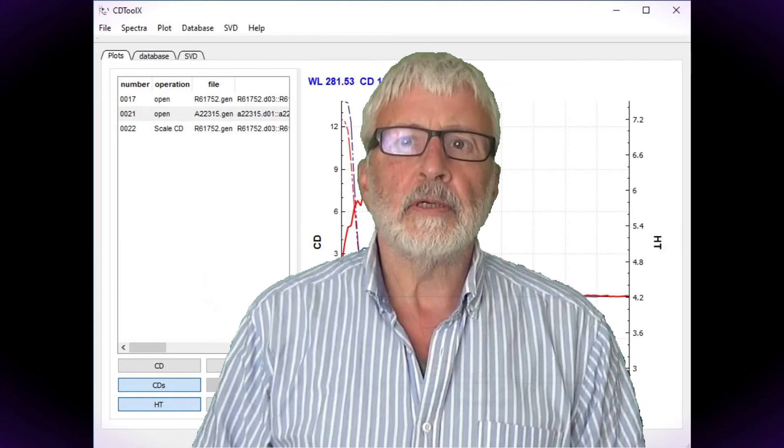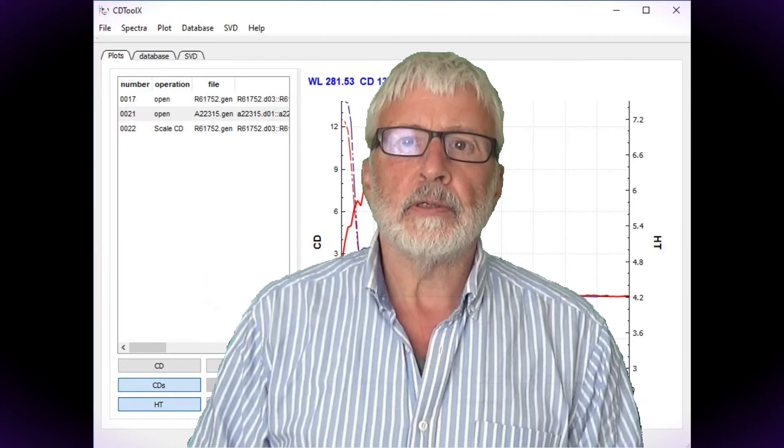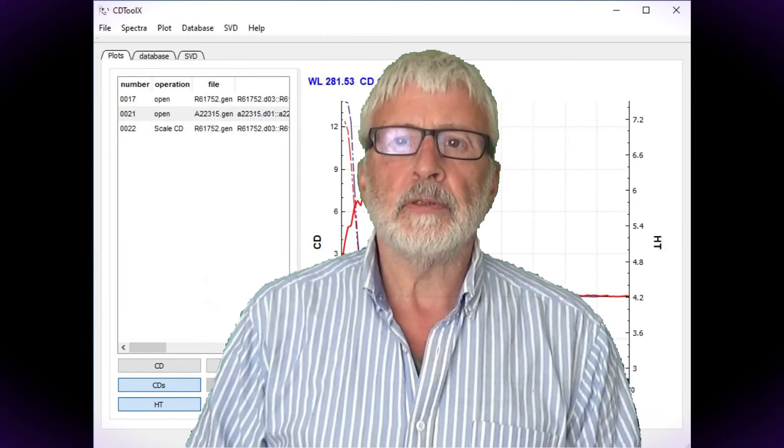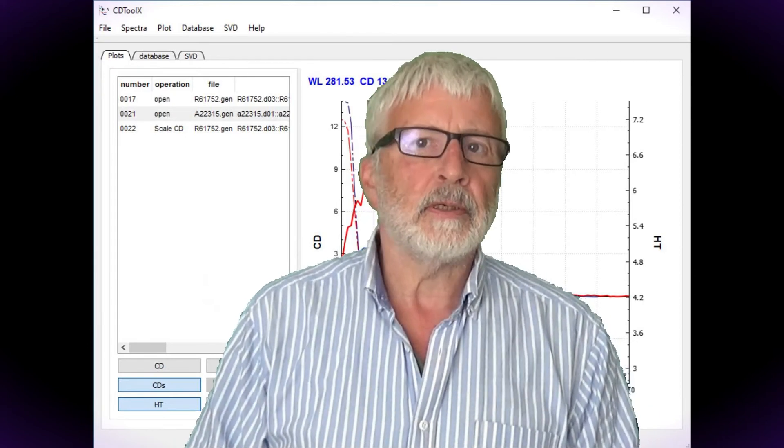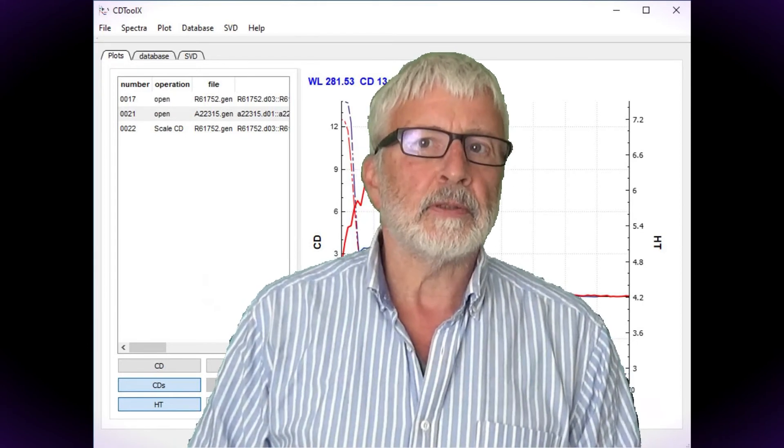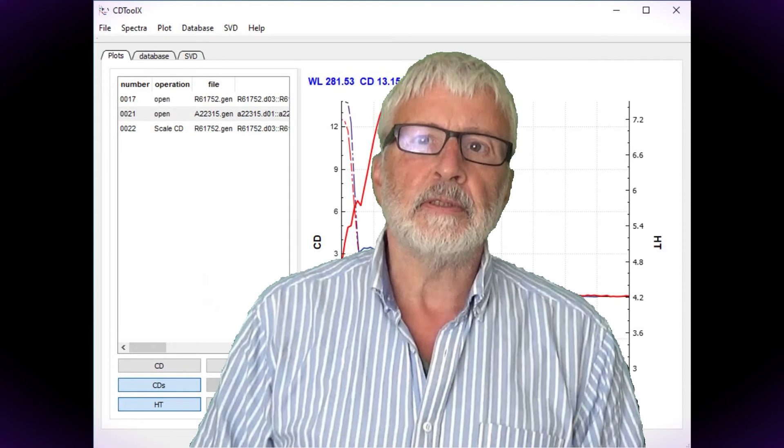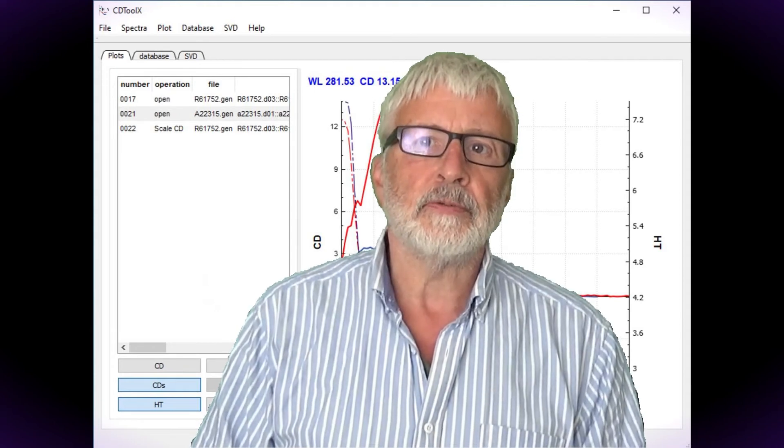Hello, in this video I'm going to show you how to process protein circular dichroism spectra using the CDToolX software.